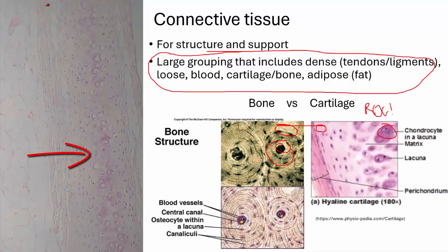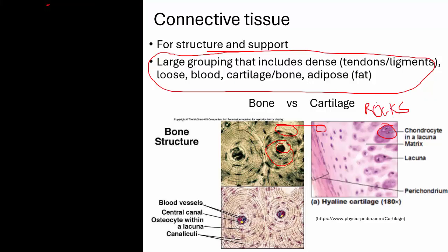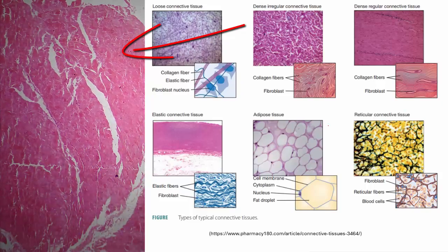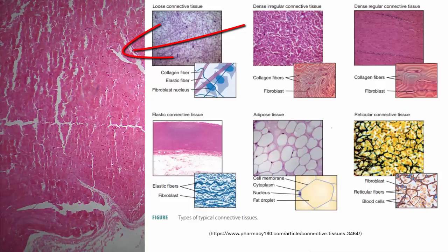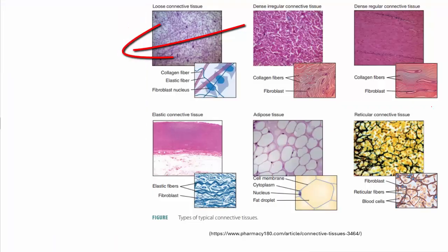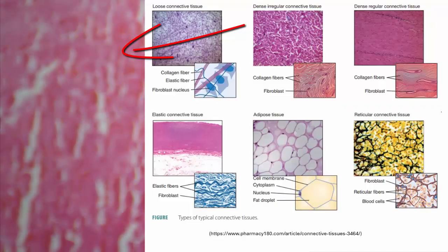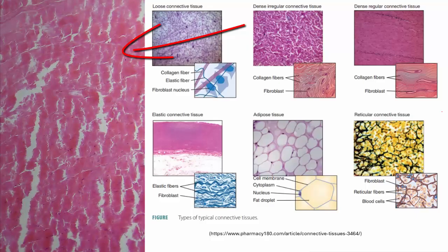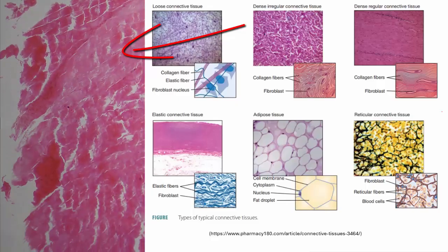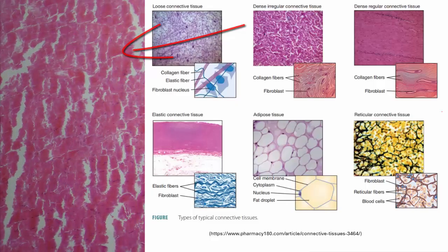Just one other one. I've gone into blood in quite a lot of detail in the first video, so watch that because blood's probably the most important one, so it got its own video. Fat tissue isn't around much because it's not very diagnostic for disease, but you can find it a little bit in some organs. Well, a lot if you're not too healthy. I've just got a tendon there, so you can see all these connective tissues. It's just cells joining different bits and pieces together and holding them together.